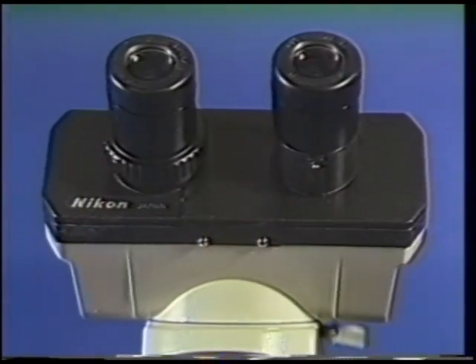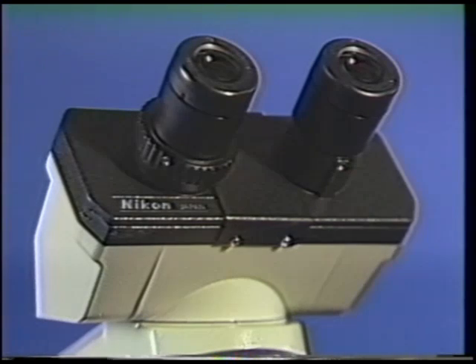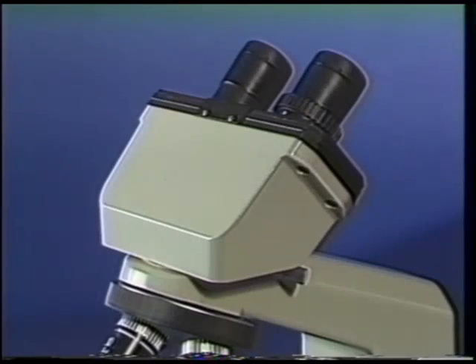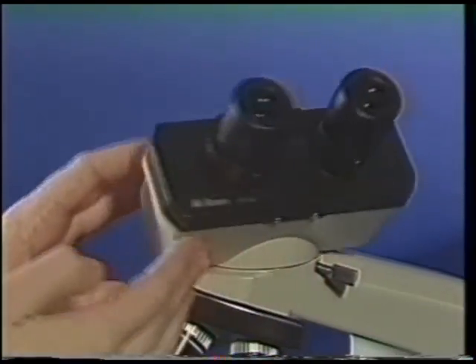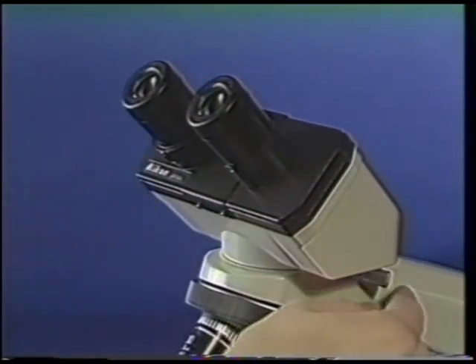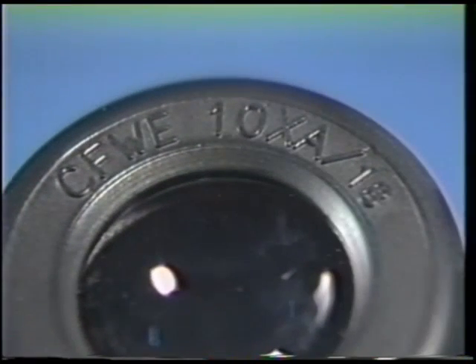The AlphaFoT II provides two oculars, or eyepieces, for viewing the specimen. The rounded eyepieces are attached to the microscope binocular head. Loosen the clamp screw, rotate the head to the proper viewing position, and tighten the clamp screw to keep the head in place. Look for the 10X markings on the eyepieces, indicating that the image received is magnified by a power of ten.